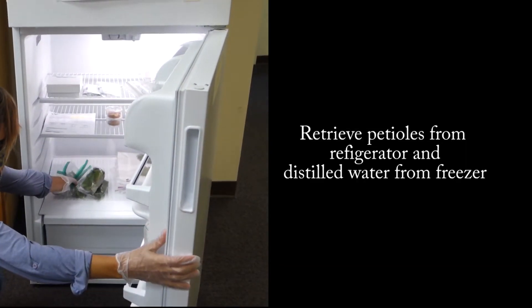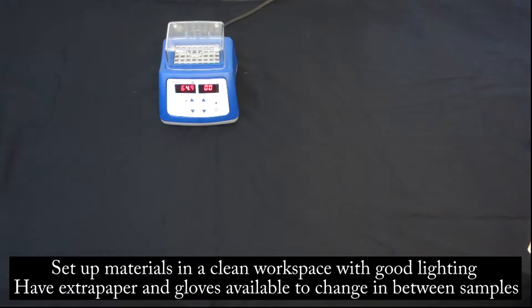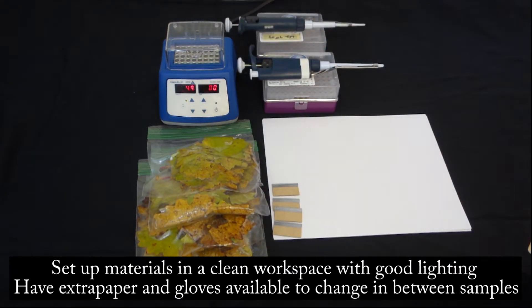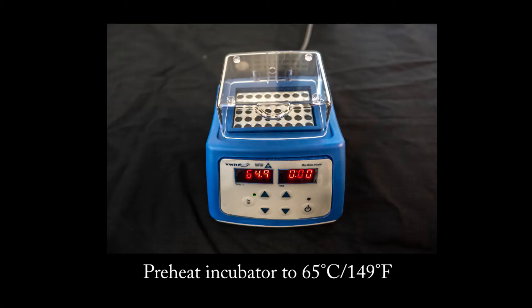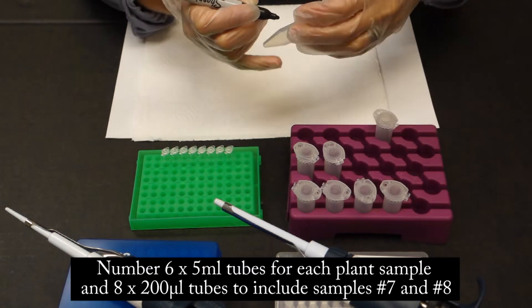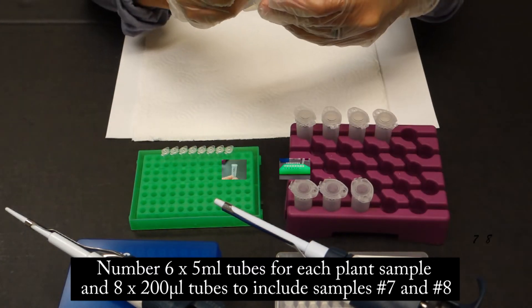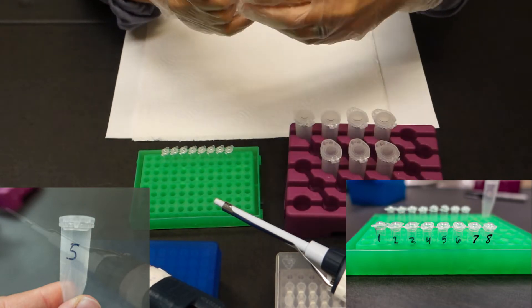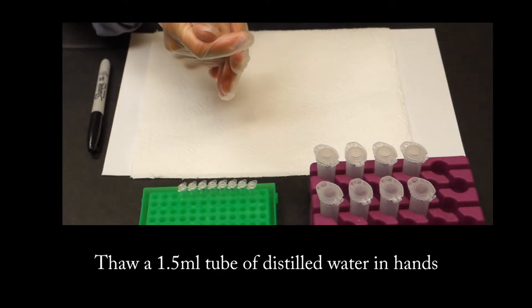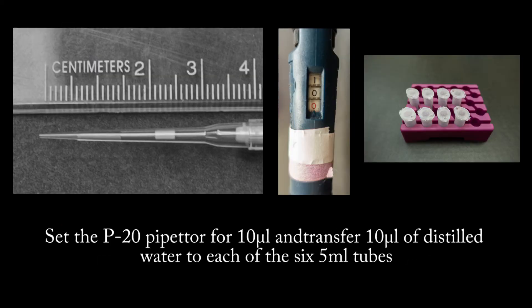Retrieve petioles from the refrigerator and distilled water from the freezer. Set up the materials in a clean workspace with good lighting. Have extra paper and gloves available to change between samples. Preheat the incubator to 65 degrees Celsius. Set out six 5 ml tubes for each plant sample and eight 200 microliter PCR tubes to include samples 7 and 8. Next, prepare plant sample solutions. Thaw a 1.5 ml tube of distilled water, then set the P20 pipetter for 10 microliters and transfer 10 microliters of distilled water to each of the six 5 ml tubes.